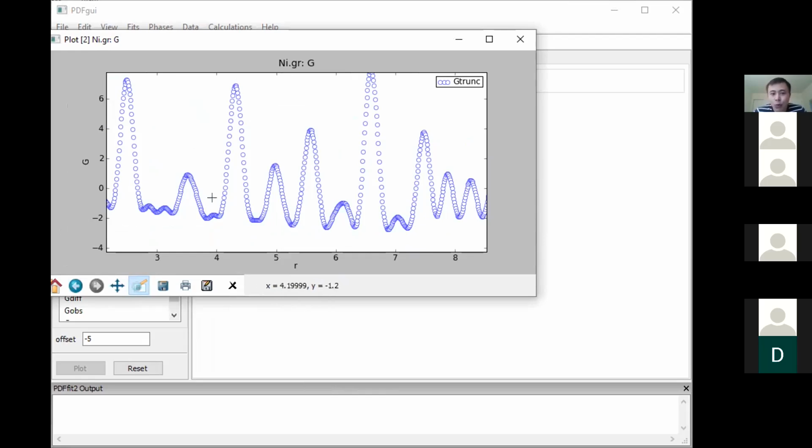So if you compare it with other peaks, this peak appears to be a little bit narrow. It's not easy to discern by eye, but through the detail of their study, it was shown that this peak is uniquely narrower than other peaks. And that relates to the atomic correlation. That's why that parameter was termed correlation.